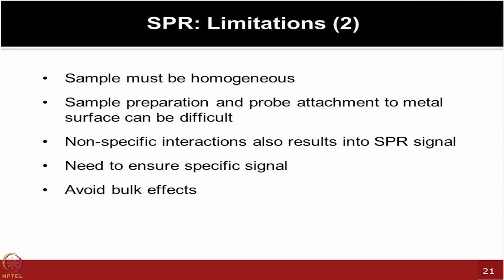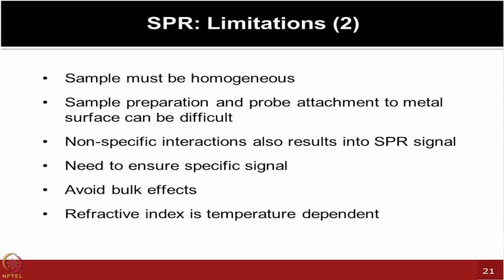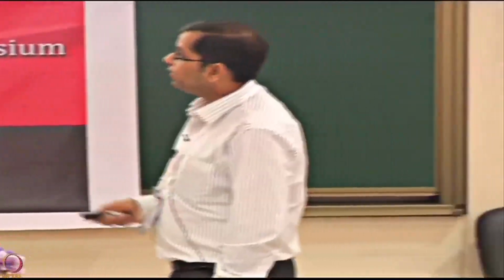Of course, many of these things in the field of label-free technologies, you have to ensure that the binding you are seeing is actually real binding, not artifacts. Sometimes you will see a reaction happening in a temperature-dependent manner, so you have to play with those. Fortunately, some of these instruments and technologies now give you a range from 4 degrees, and you can vary up to 37 to 50 degrees to try out different conditions.